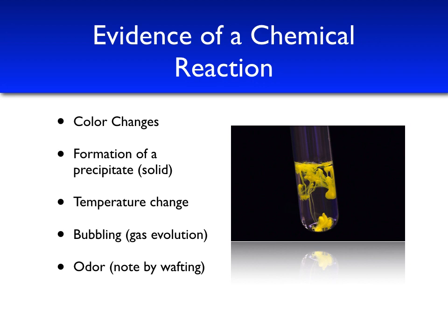Finally, you might also note the formation of an odor. If you smell something, that usually means it's a gas. So this is also evidence of gas formation. We want to note here that to safely note an odor, we do this by wafting. That is, we wave our hand over the test tube towards our nose to get a small amount of the odor. However, you'll see in this experiment that is not even needed. The smell is going to be pretty evident for one of the reactions.